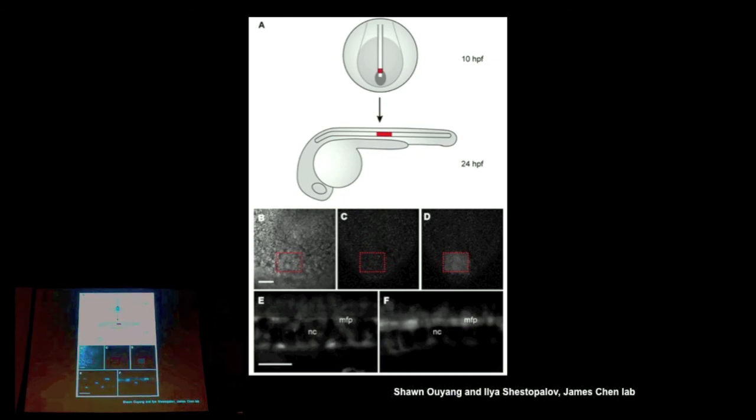The size of the laser spot for uncaging is the same as the point spread function. It's a different process for 2 photon, but it's going to be the 2 photon point spread function. I mean, 1 photon, for example UV light uncaging: if you did single photon uncaging, you're going to end up with uncaging over a much larger volume.